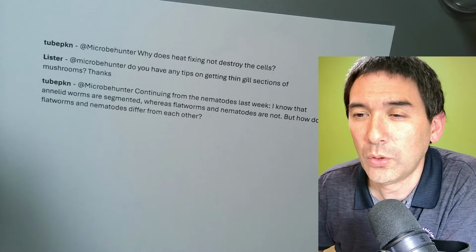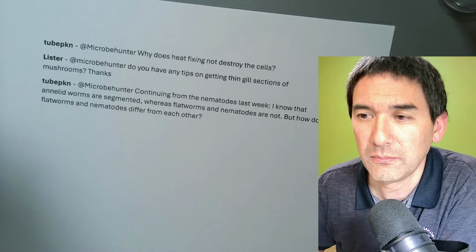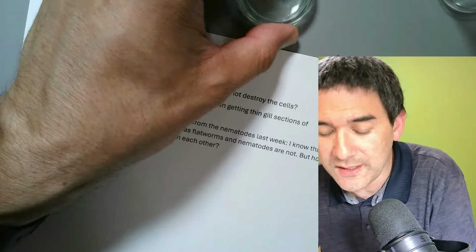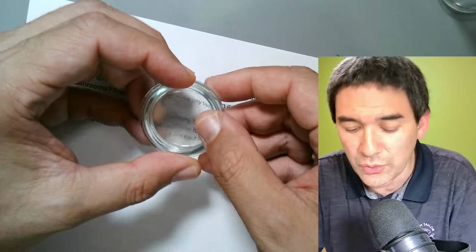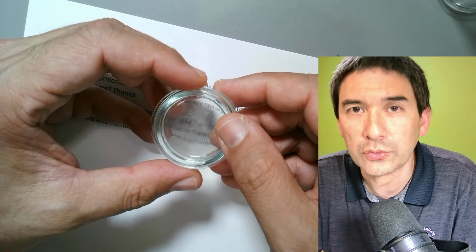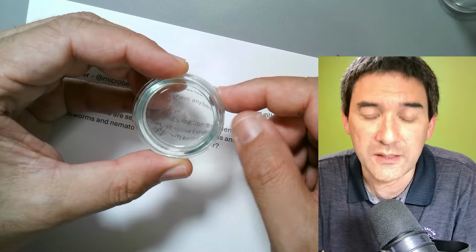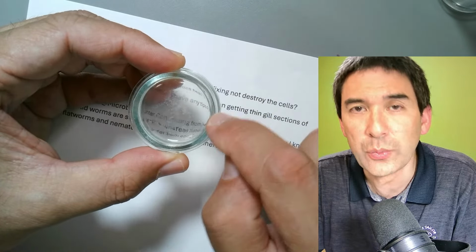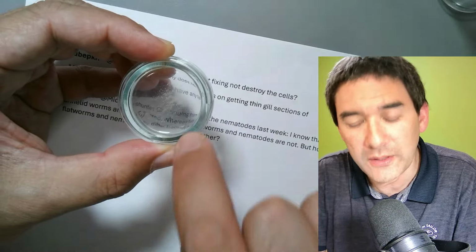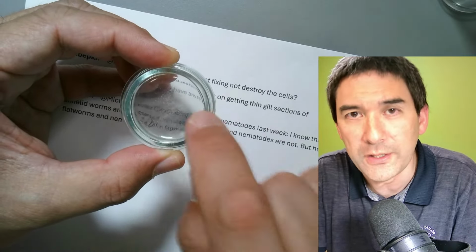Yeah, but more often than not, the thickness of a Petri dish makes it difficult to observe things properly as compared to a slide. Yes, I probably would agree. However, if you're using inverted microscopes in a so-called cell culture, where you're growing, for example, human cells, then very often these cells will not swim in the medium, but will stick to the inside bottom surface of the Petri dish.